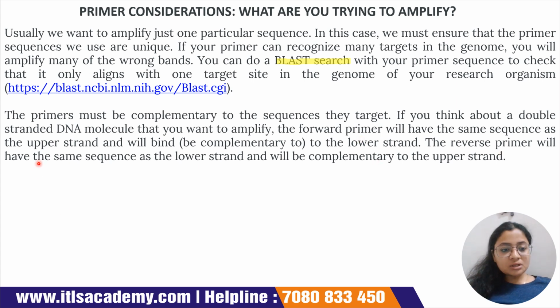If you think about a double-stranded DNA molecule that you want to amplify, the forward primer will have the same sequence as the upper strand and it will bind to the lower strand. What is the difference between the forward primer and the reverse primer? The forward primer has the same sequence as the upper strand of your DNA, and it is complementary to the lower strand of the DNA. That is the forward primer.